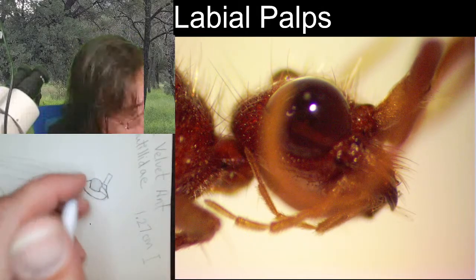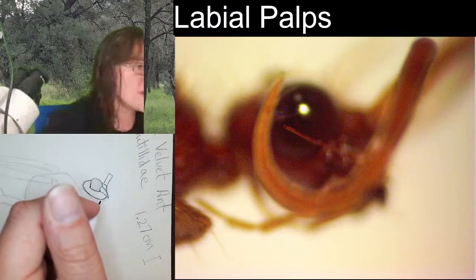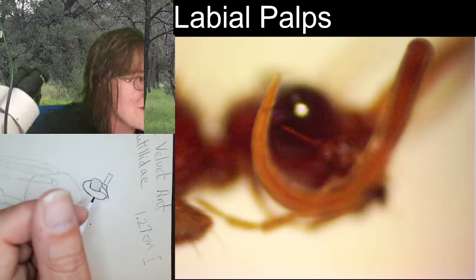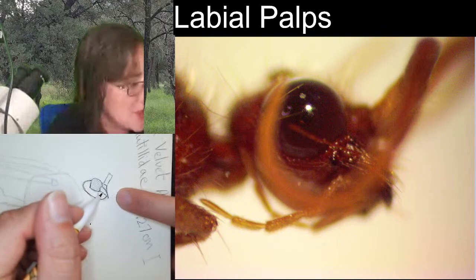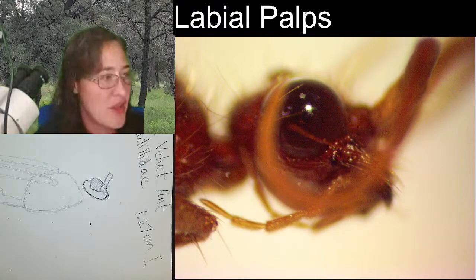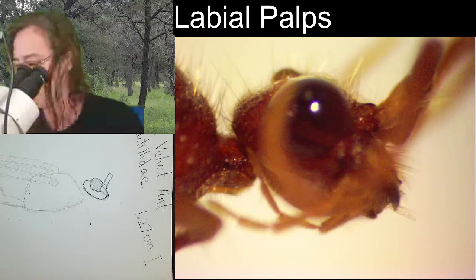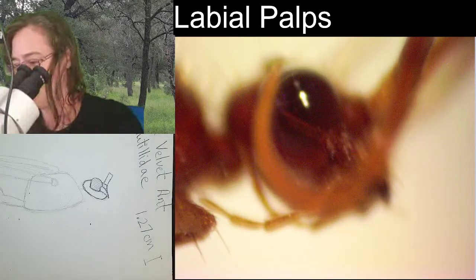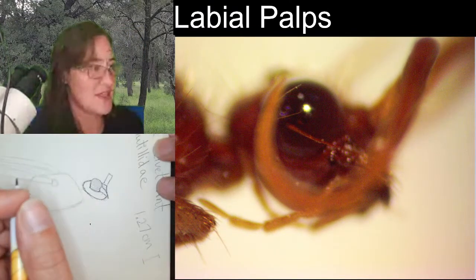All right, so it's really hard to see a lot of those mouth parts because they are underneath the antennae, and unfortunately we can't just focus past them. But I do know whereabouts those palps are coming out, so they're going to be coming out right here from directly underneath the mandibles, and they appear to be, let's see if I can count the segments. 1, 2, 3, 4. Four segmented. There's one segment that's hidden underneath the antenna.